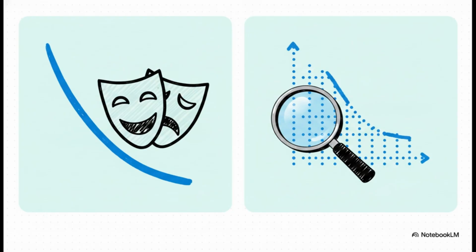But look at the raw signal side. This is where the absolute truth lives. Plotting your raw optical density, or luminescence, will immediately reveal a clear downturn or a plateau right at the top. Seriously, always check your raw data before you blindly trust the software's smoothed-out perfect version.